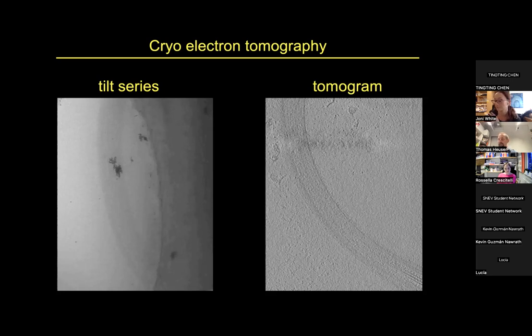If you want to prove to someone without any doubt that this is an extracellular vesicle, then chemical fixation might not be the method of choice. But if you're interested in studying biogenesis inside a cell of EVs, and this is the only method available, yes, absolutely, go ahead and do it. And if you do this combined with tomography, then of course you will get valuable 3D information from it. Yeah. Thank you so much.